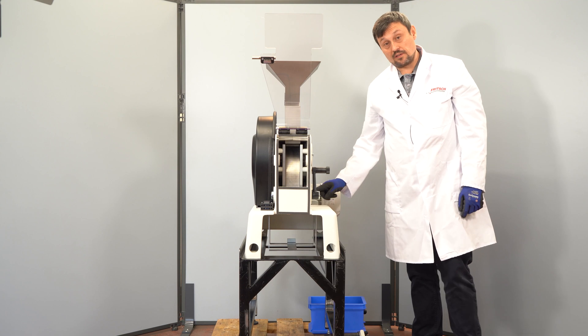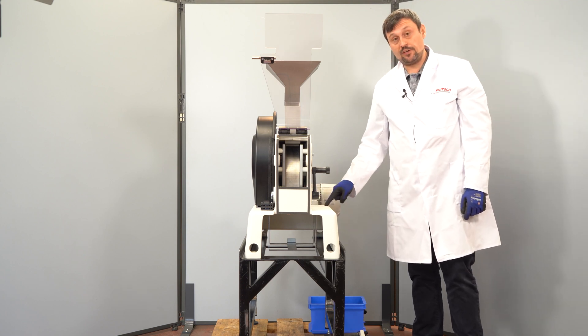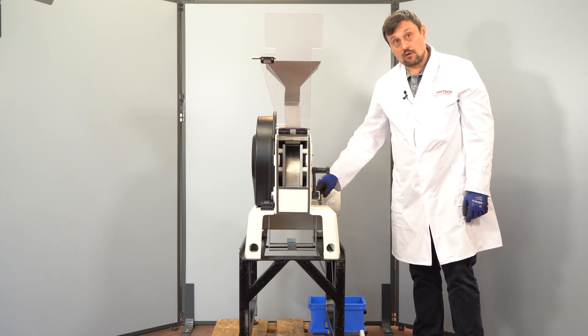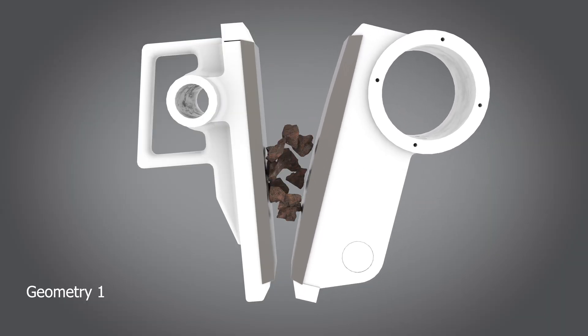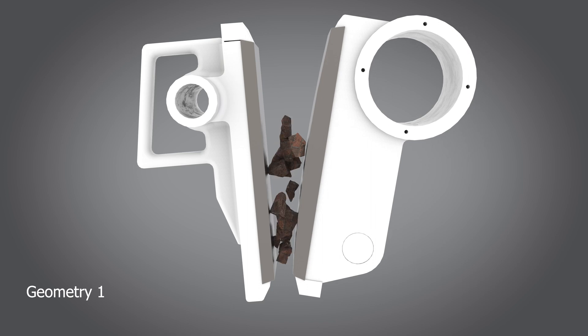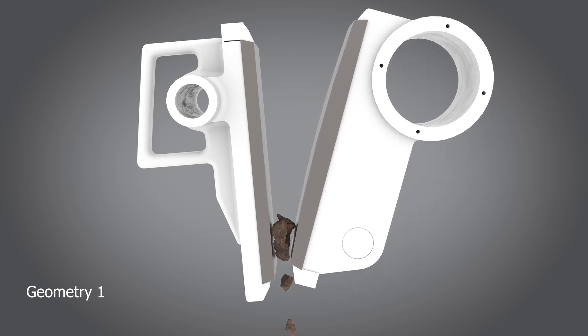Please note that the standard grinding geometry is on the bottom. What is the difference between these two grinding geometries? You will see this in the following animation.